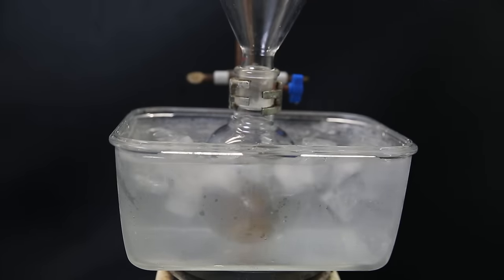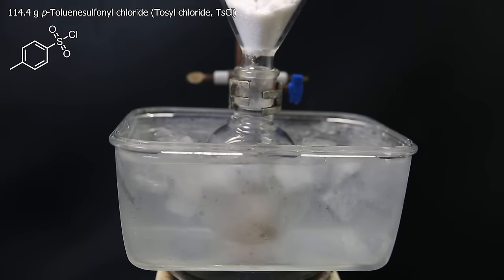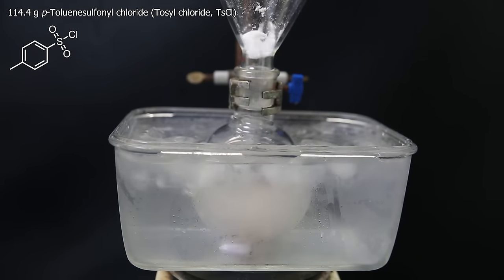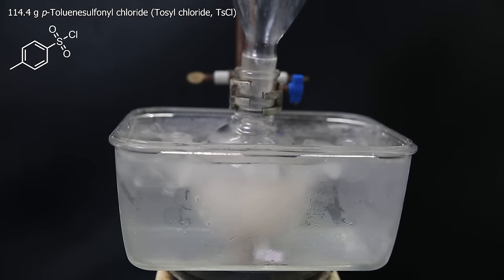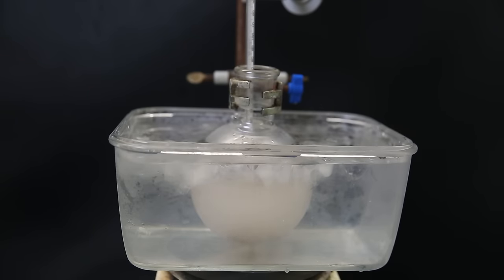And then attach a funnel, and add in 114g of p-toluene sulfonyl chloride, also called tosyl chloride, or shortened to TsCl. I then let this stir for a few minutes, to allow it to cool down.